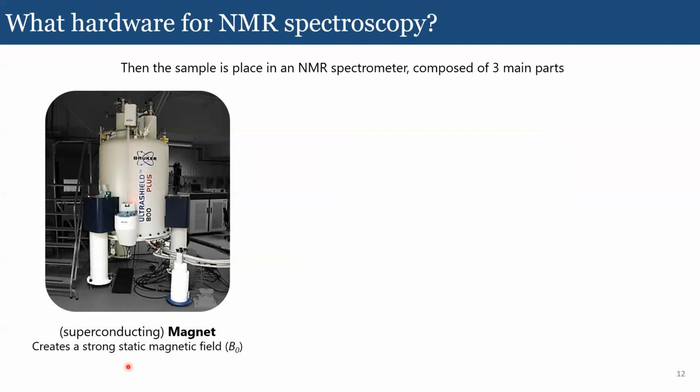And that's usually put on the door, because when you are entering an NMR facility, you have to remember that all of these things are pretty much large magnets with no off button. So when you are going close to them, you have to be careful and not, for example, carry metallic keys, or you're gonna have a bad time. So if at some point you go into an NMR facility, just be careful and follow safety rules, please.